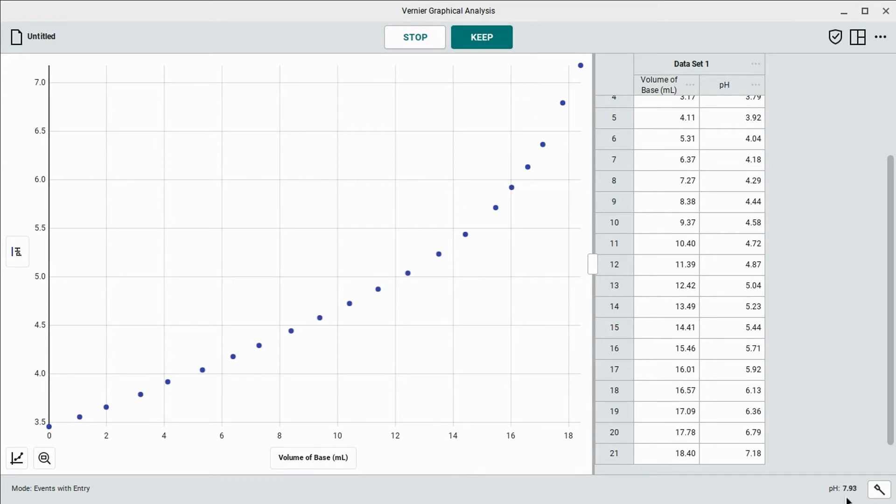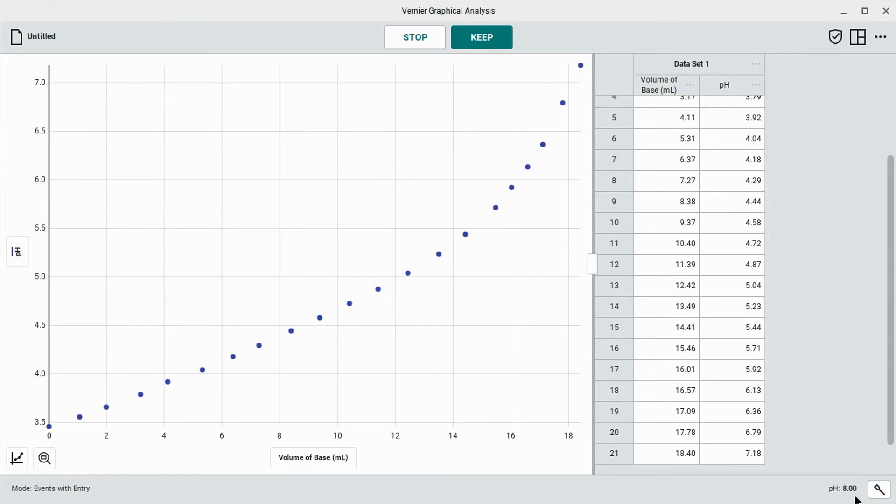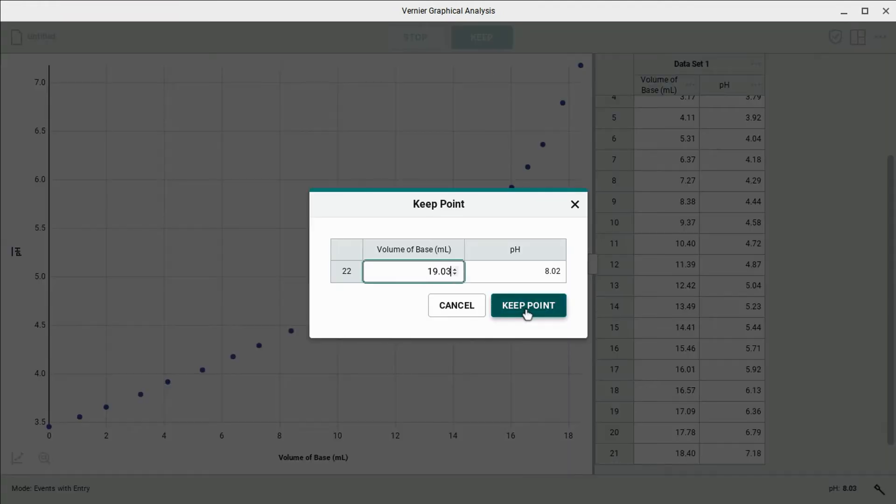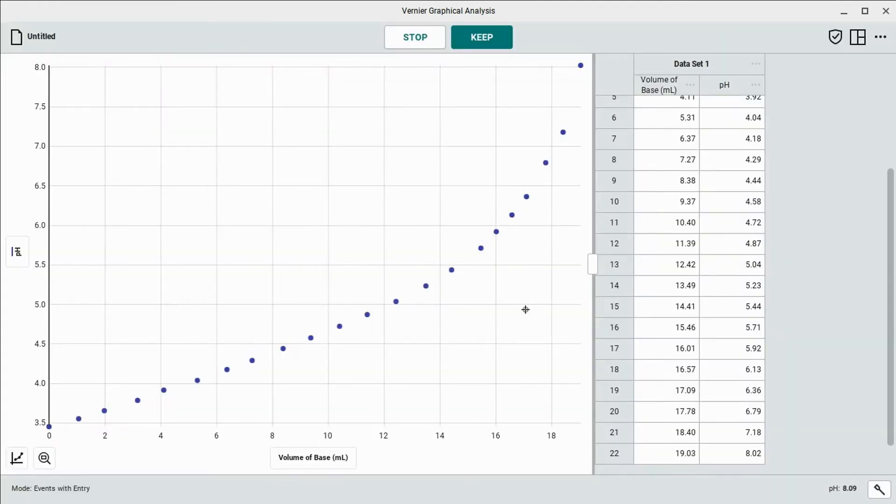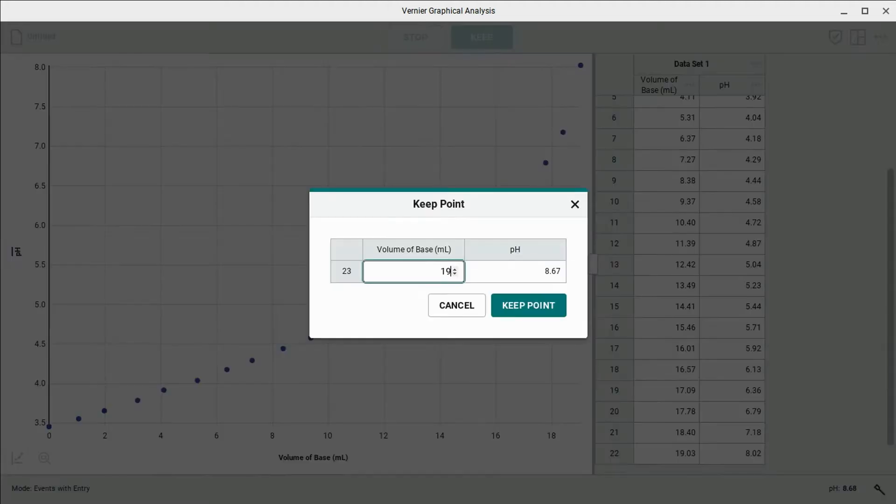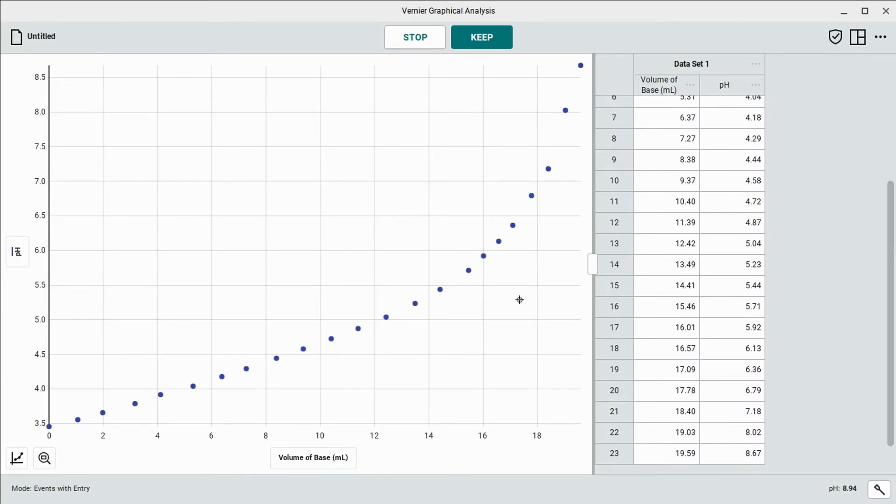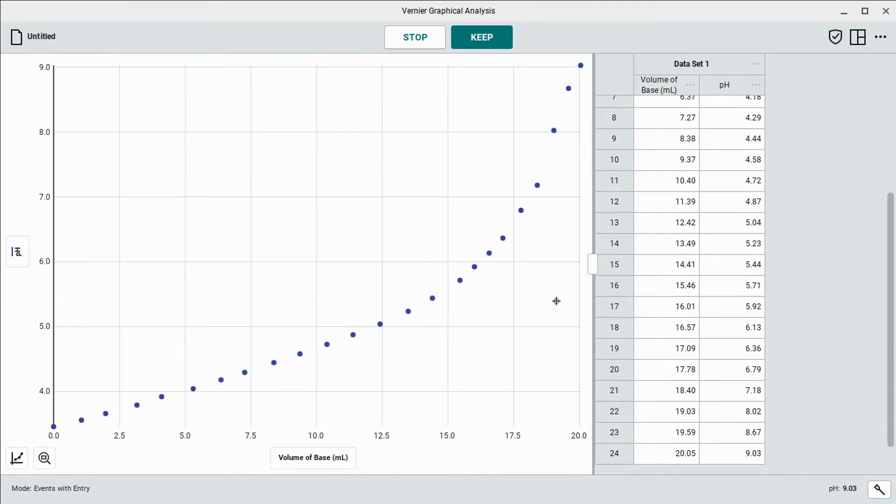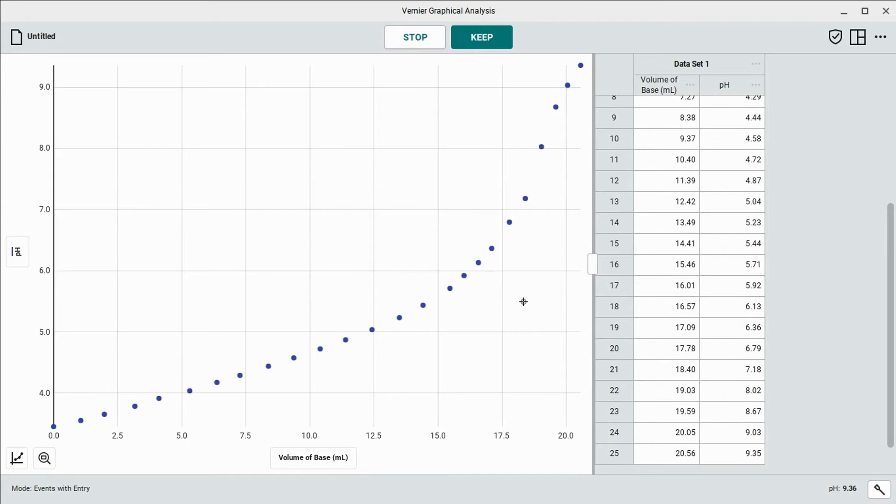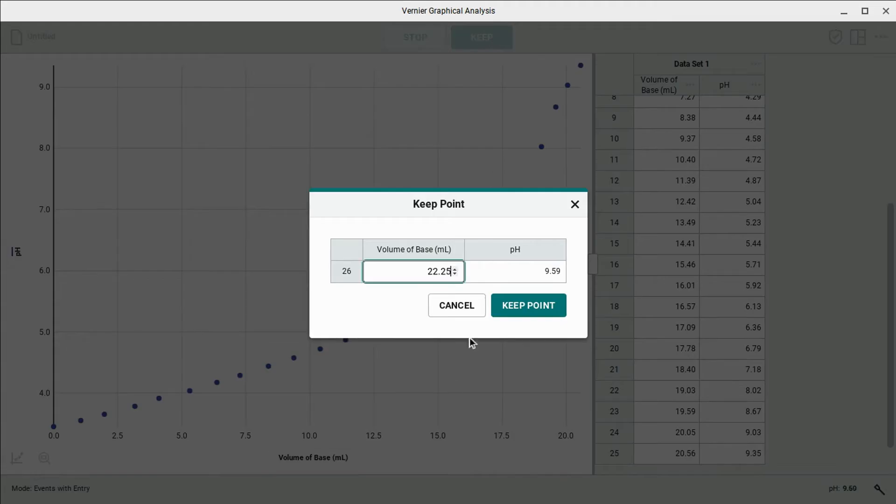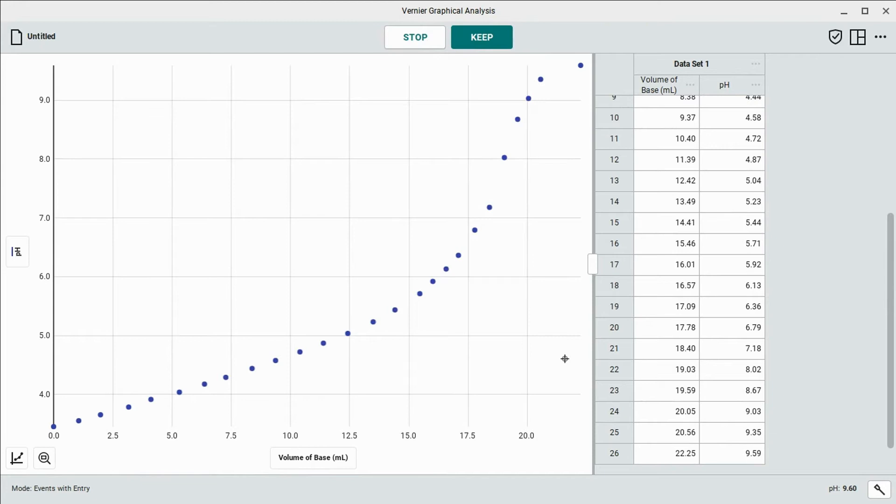So after adding a little bit more, you can see here that the pH level has increased a whole bunch and it's still climbing. So we're going to wait for that to stabilize a little bit before adding the next point.